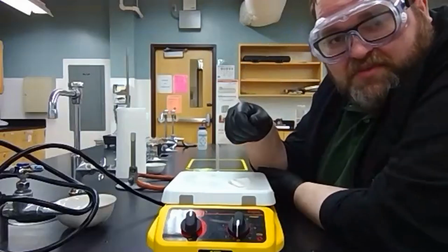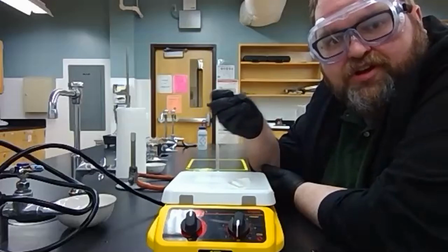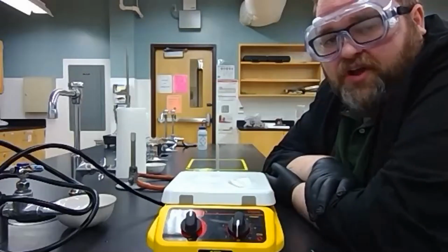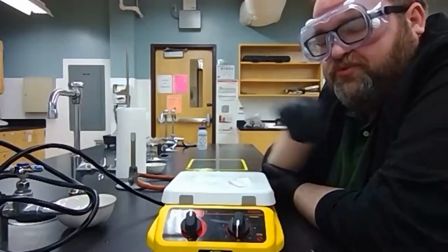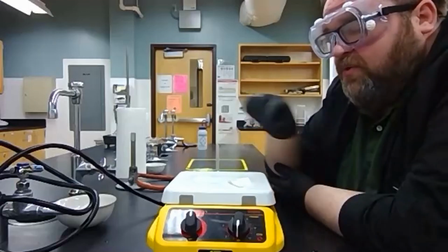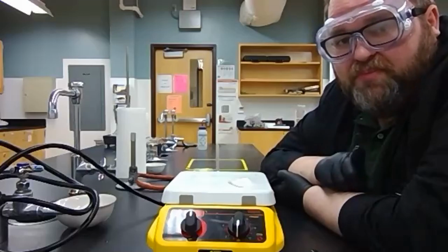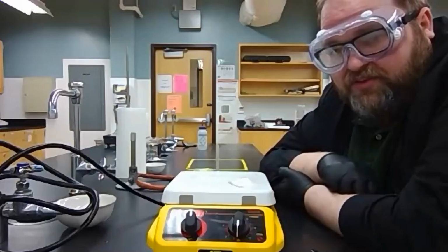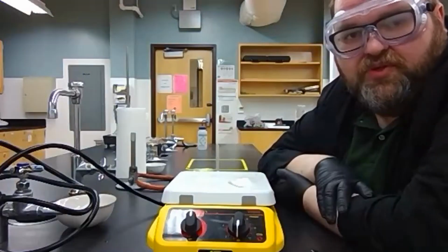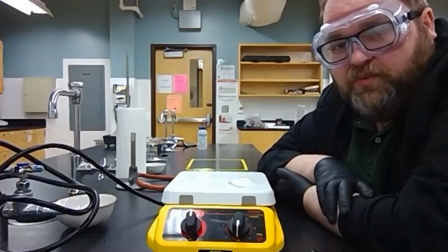You're going to see some steam come off of it. That's normal because it's water and it needs to have steam for it to heat up and dry that water down. You'll know that this is done because the sand will start to freely flow inside and it will sort of slump down. Okay, if not, wait until the paper is crunchy but not burned. We want to make sure that we never burn our paper because that changes the mass of the filter paper, and we're going to weigh this in the filter paper so that we don't lose any. So it's just a waiting game. So let's wait.